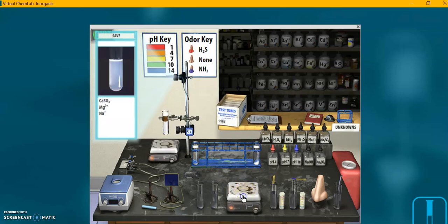Now, I'm going to heat it. Click on the heater. And it's automatically on. Automatically heats it instantly. And you can see it's made a white precipitate. Not as obvious as last time, but the chemical list here does show that we have calcium sulfate. And that would be precipitate. Okay.